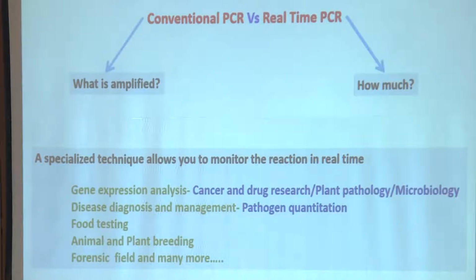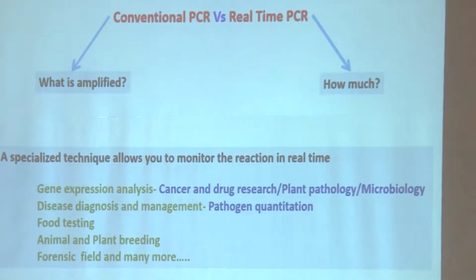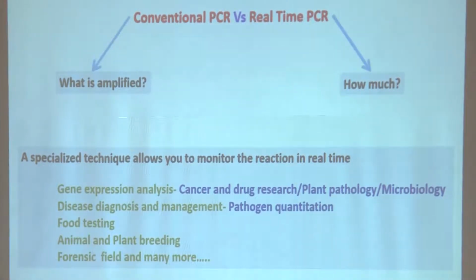This is a specialized technique that allows you to monitor the reaction in real time. What is happening in the PCR is monitored in real time. The webcasting is all about that only, isn't it? It is a real time monitoring of events, right. Of course, the applications are plenty, let us not get there.